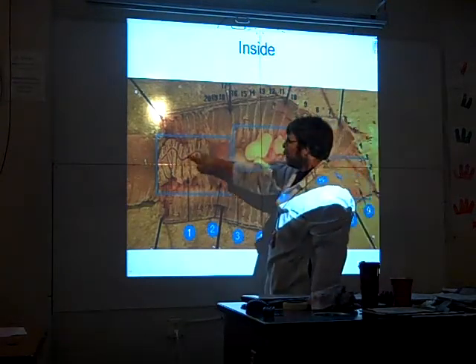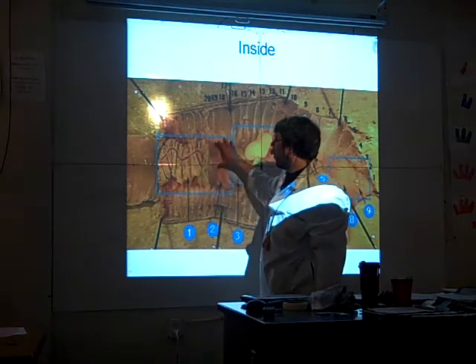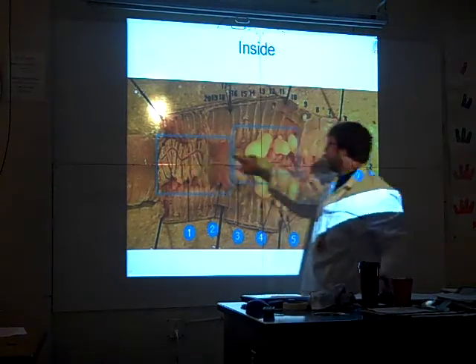Everybody see this black line here? Guess what that is? Intestine. This whole thing's the intestine. The black line, that's the dorsal blood vessel. It goes all the way up here.